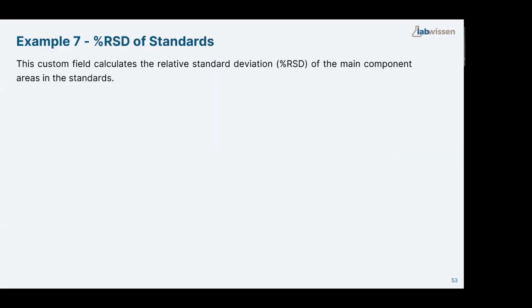So now we come to one of the most interesting parts of custom fields, intersample calculations. We haven't mentioned them before. These are the calculations that are done between different samples, between different results. Before that, we did all custom fields per result, per sample, per peak, but not between, like inside the whole sample set, when we need different samples to be combined.